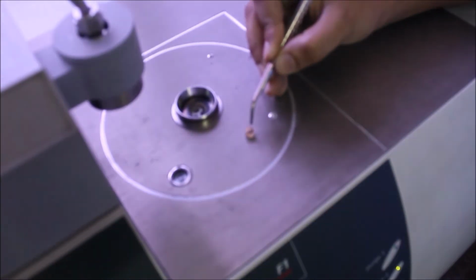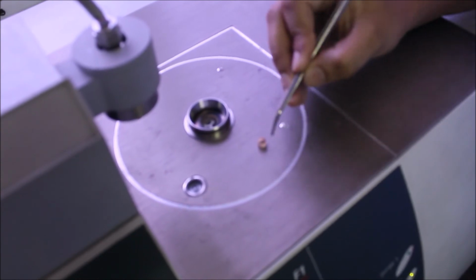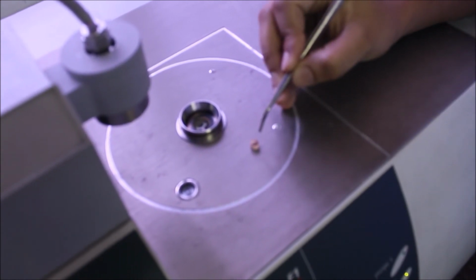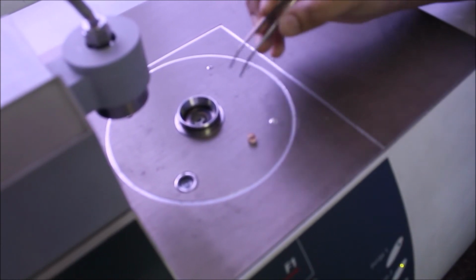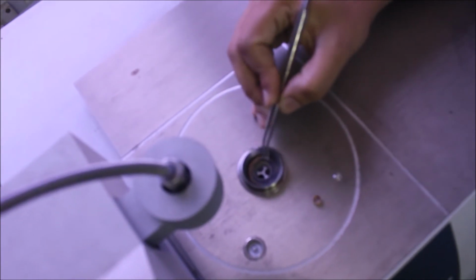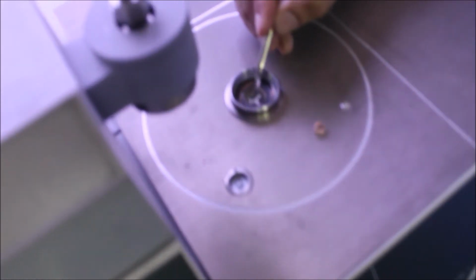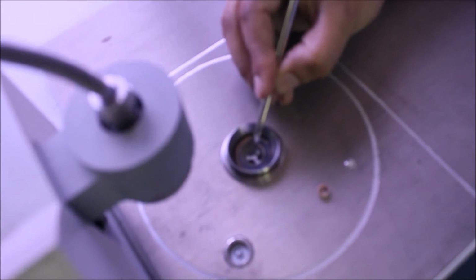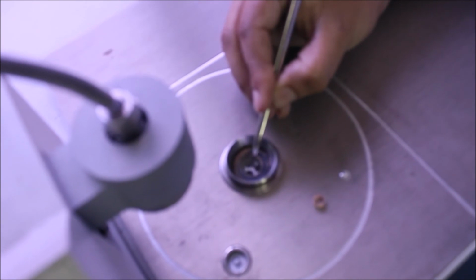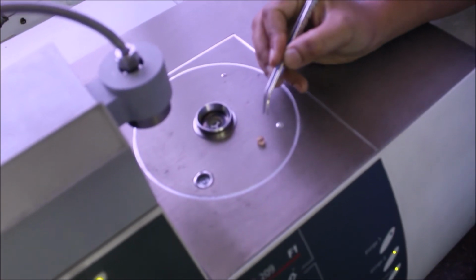This is a crucible. This is made of alumina material. It can go up to a temperature of 1600 degrees centigrade. So here we will put the sample for our experiment. This is actually the furnace of the instrument. This is the sample holder. There is a thermocouple over here that will measure the temperature of this crucible and the sample.